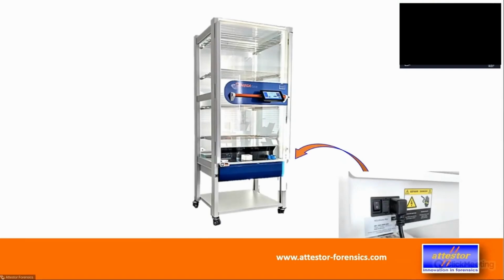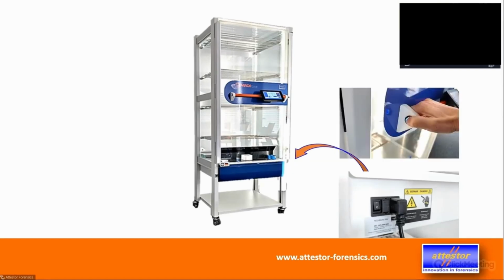You have a plug on the side with an integrated power supply. One thing we didn't like with one of the vendors we sold before was this external power supply, which was a very, very noisy thing, permanently running in the lab. We said we want that to be silent, so our system, when it's in standby or when it's operating, doesn't make any noise. So this is just where you put standard 230 volts in there.